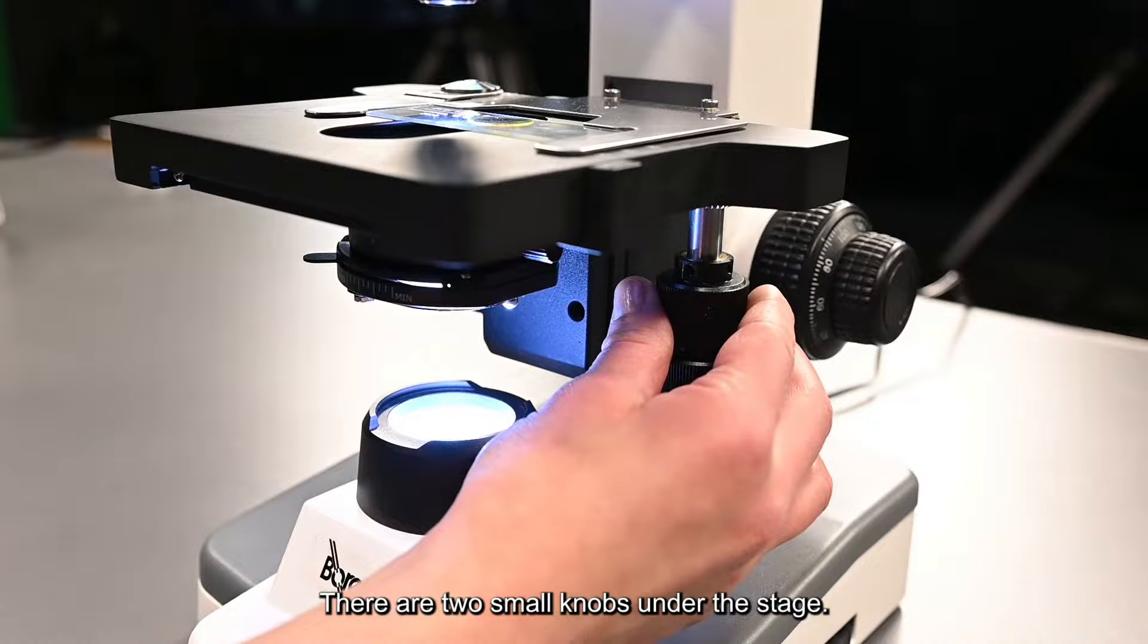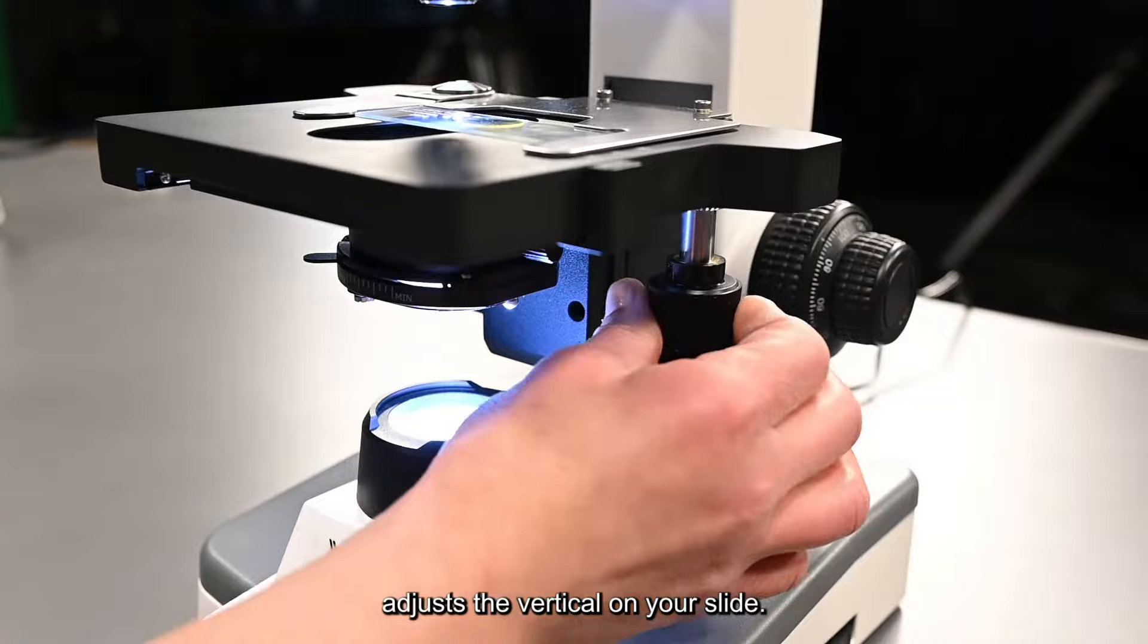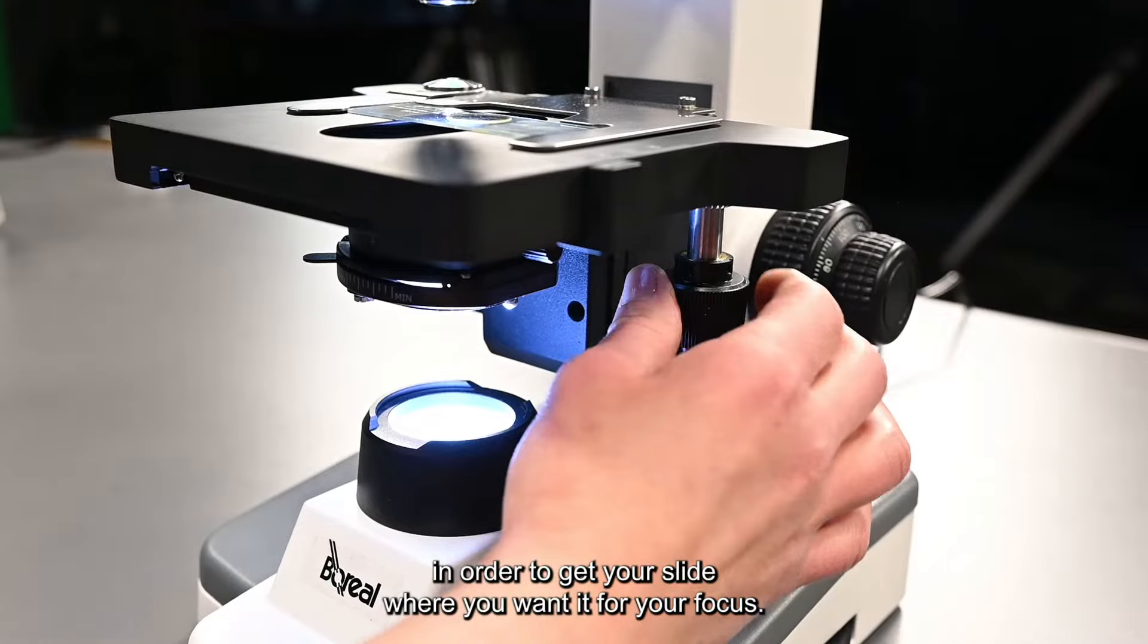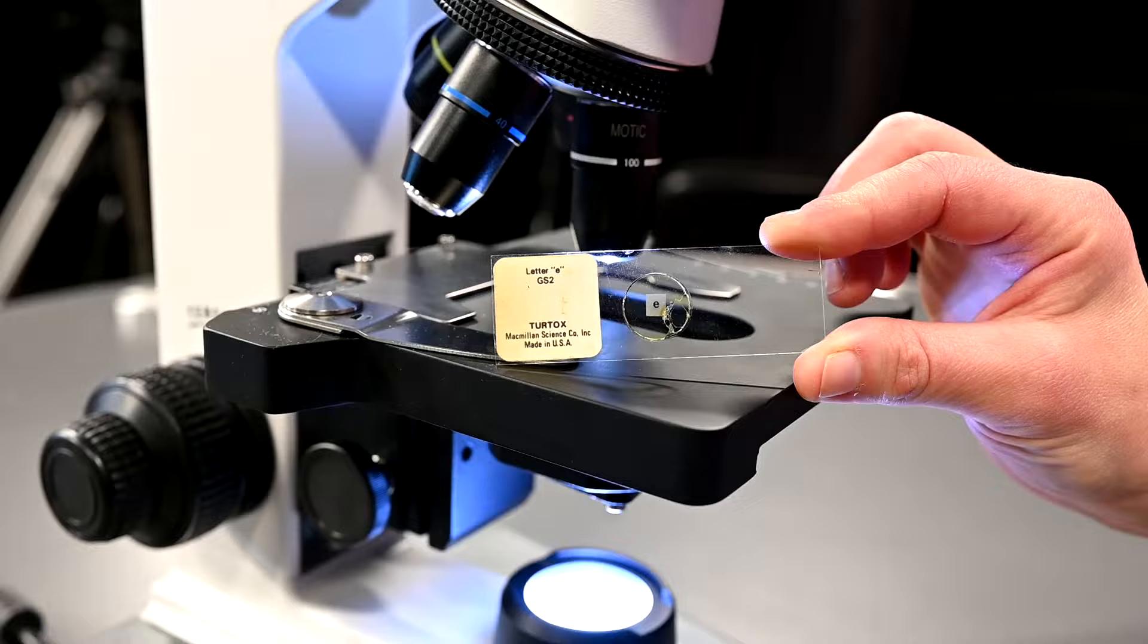There are two small knobs under the stage. The top part if you rotate it adjusts the vertical on your slide. The bottom one if you twist it adjusts the horizontal on your slide in order to get your slide where you want it or your focus.